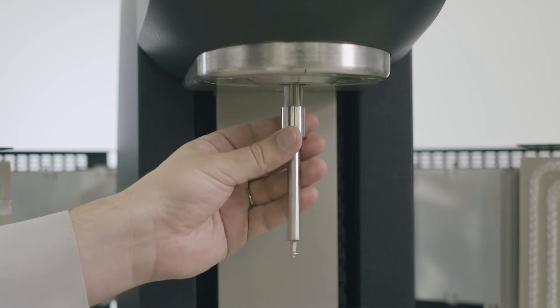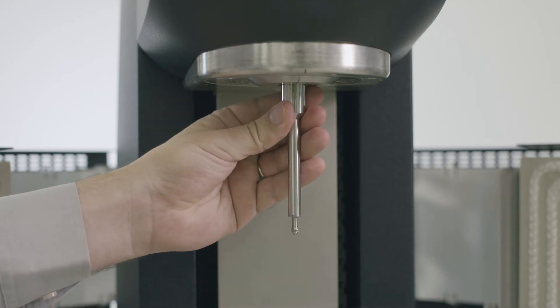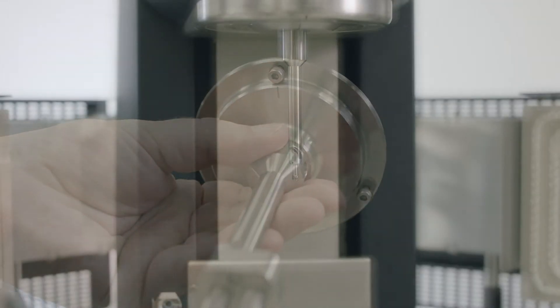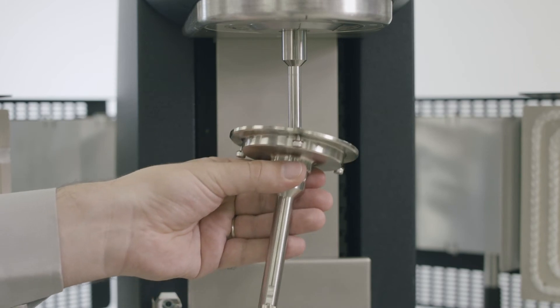Install the driveshaft onto the rheometer using the standard draw rod. Line up the EVA assembly with the driveshaft and slide the EVA assembly over the driveshaft.